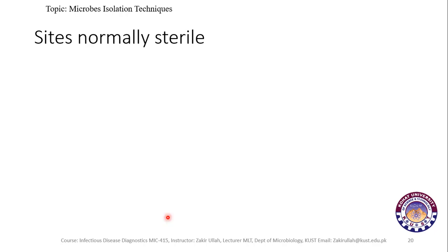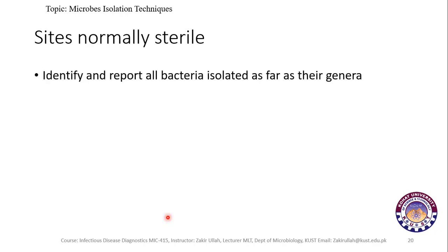For the normally sterile sites, identify and report all the isolated bacteria and report their genera. If possible, identify the actual species.